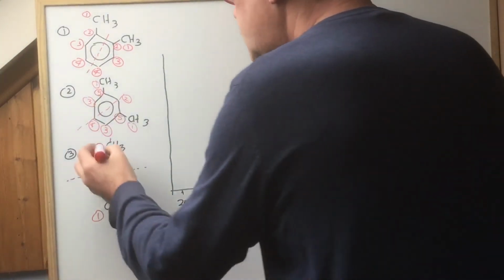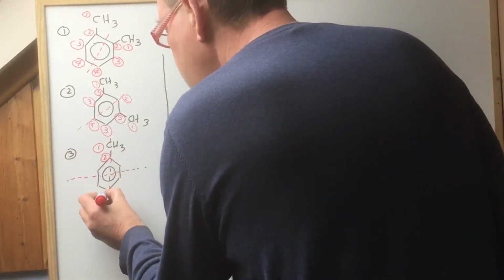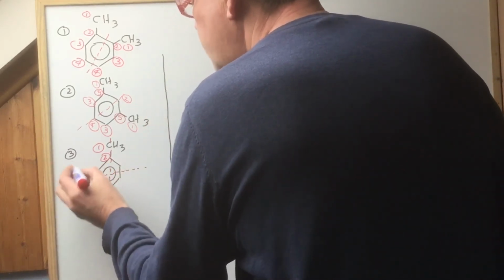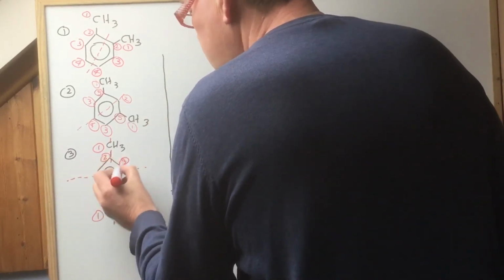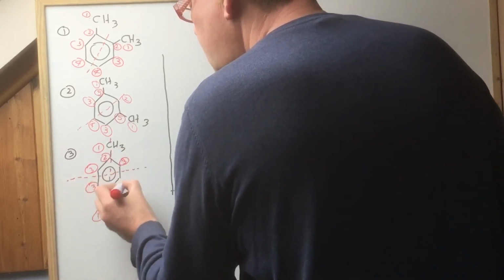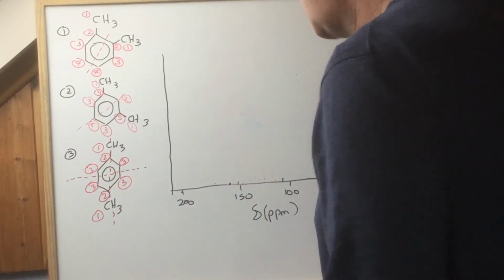Anyway, if you've got this one, 1, 1, 2, same, 2. And you know what? Love this. 3, same, 3, same, 3, same, 3, same. It's only 3 different environments in that molecule.